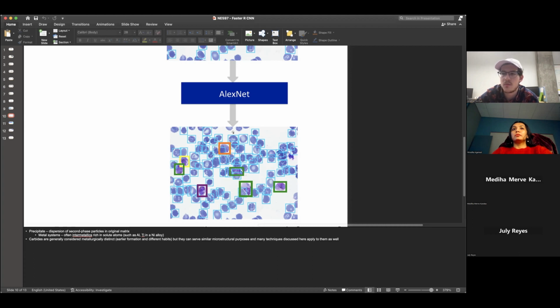They have a significant amount of data to isolate what is or isn't a red blood cell, but following that, actually characterizing what the different cells are, they didn't explain it super well why they did this. But with the use of AlexNet, they had a sufficient database that they could get better results that way. I didn't have a great understanding of why they did it though.